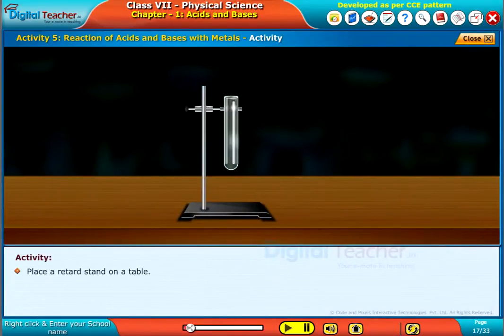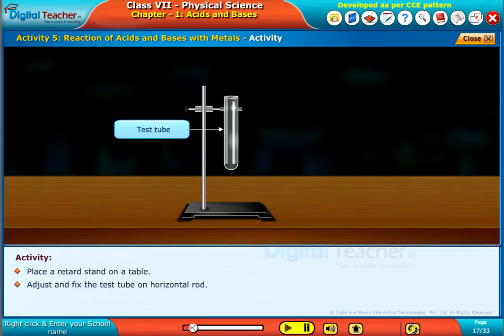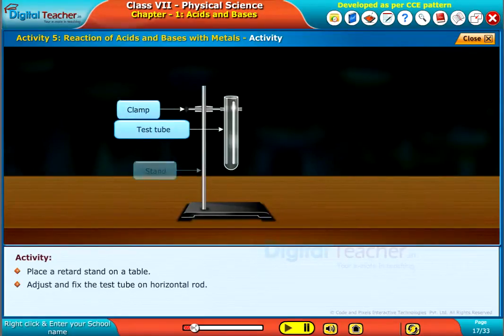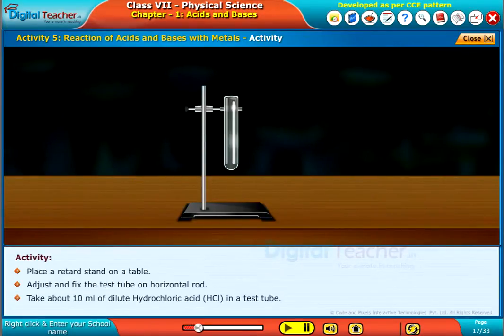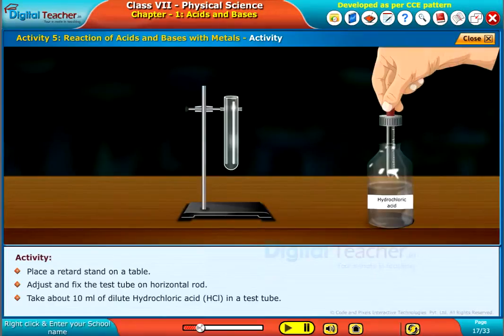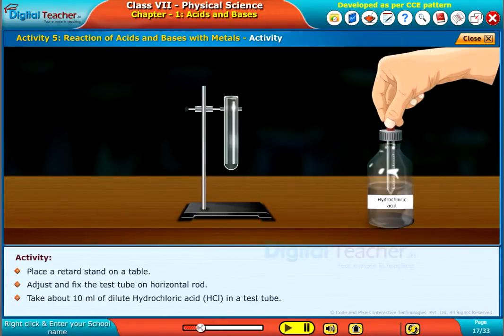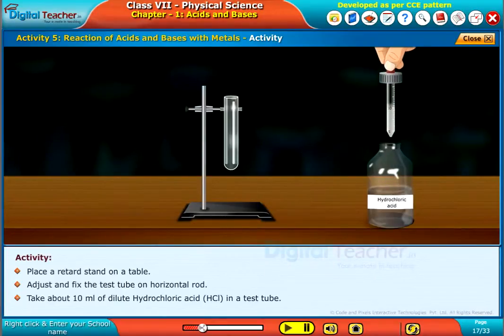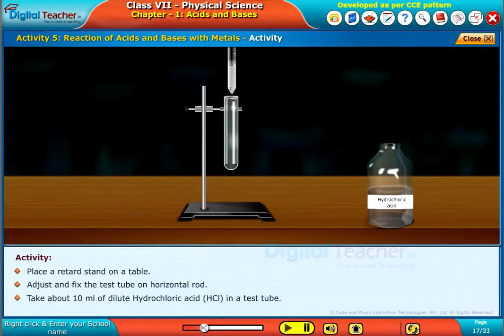Place a retort stand on a table. Adjust and fix the test tube on the horizontal rod. Take about 10 ml of dilute hydrochloric acid, HCl, in a test tube.